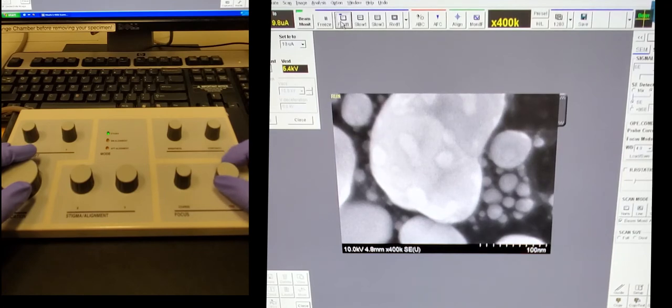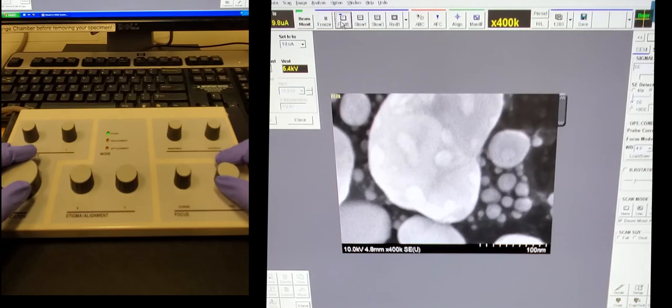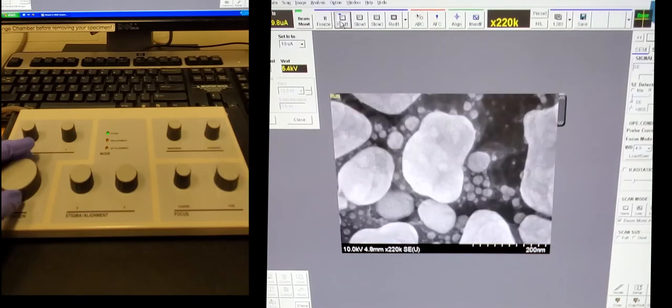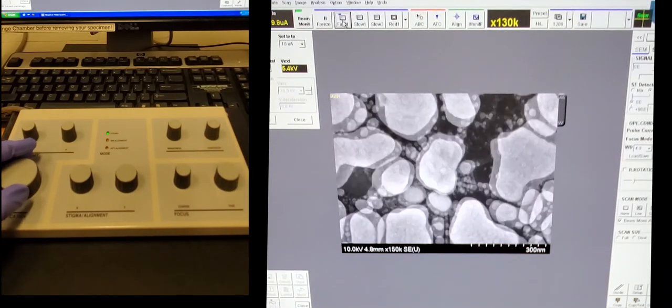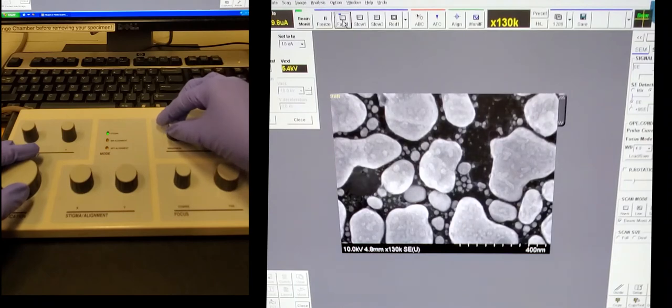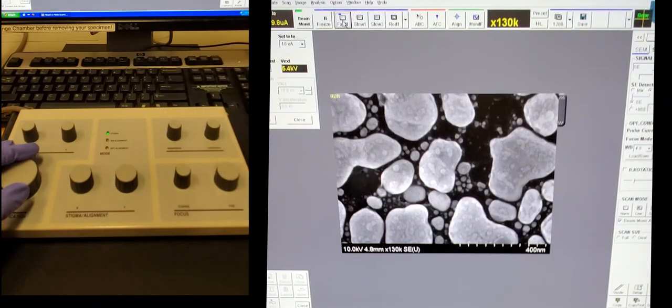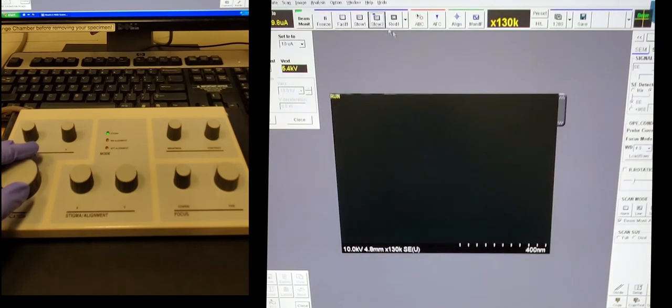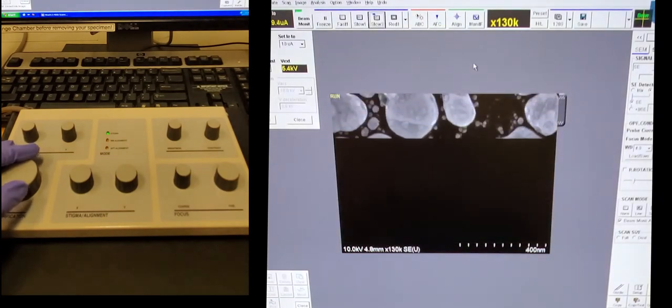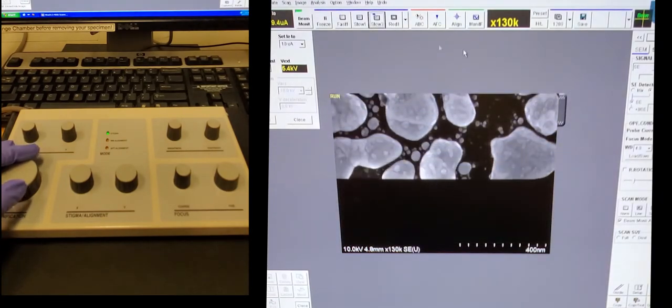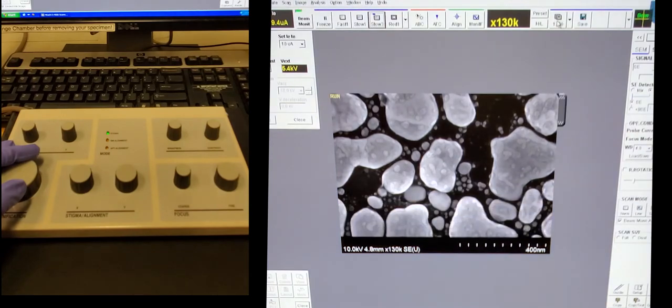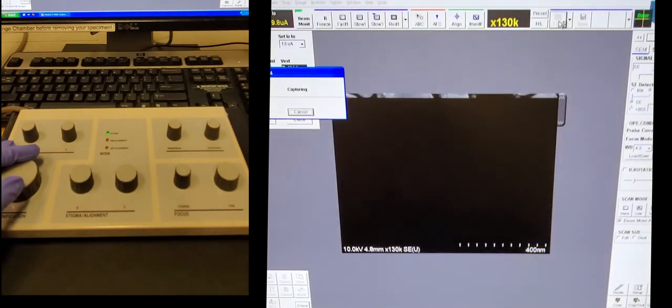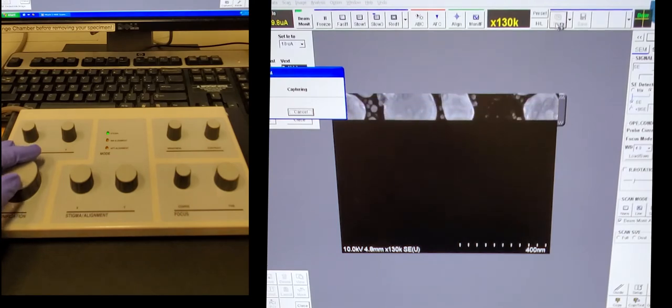Now for final touch, I adjust the brightness and contrast. Go back to the slow scan. You can see the image looks pretty good. So now I'm going to press this button and this button allows you to actually capture the image.